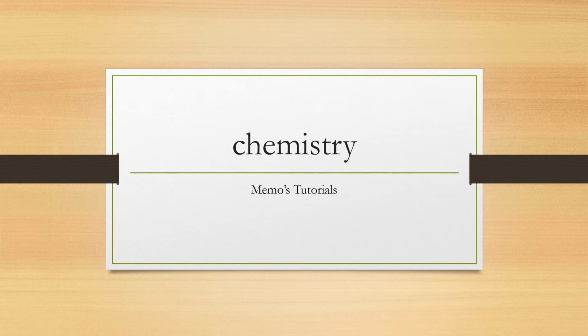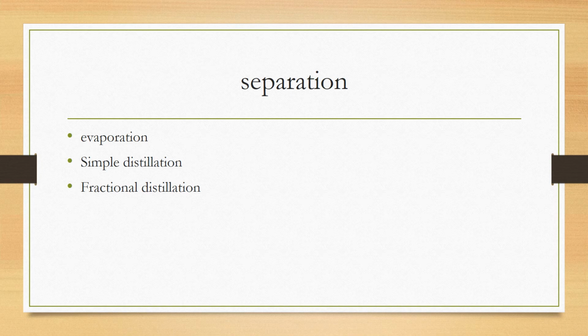Today we are focusing on chemistry and we'll be looking at separation. So we have got three ways that we are going to talk about. Firstly being evaporation, followed by simple distillation and fractional distillation.